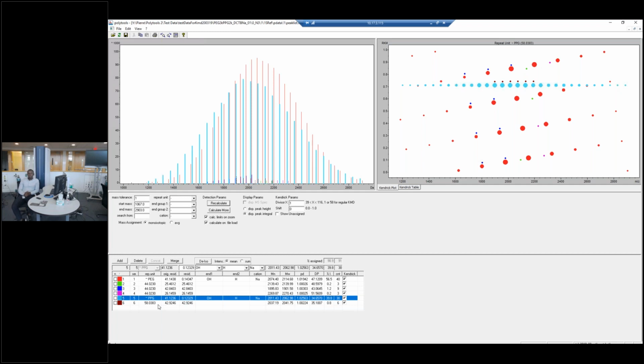Right. So our target is ground steel targets. They're pretty robust, pretty hard and durable. Unless you're scratching it with a metal really, really hard, there shouldn't be any issues with the target.